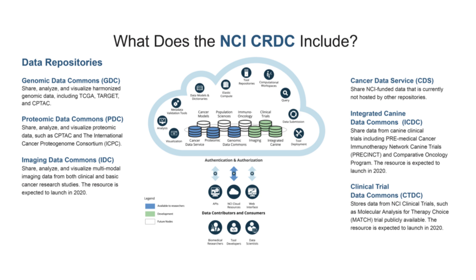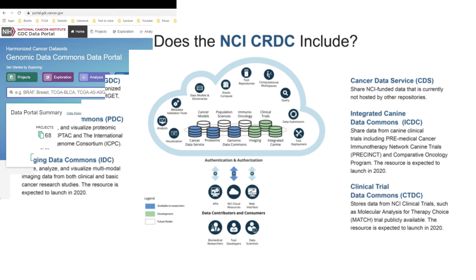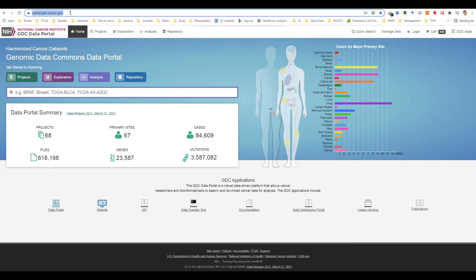The Genomic Data Commons GDC data portal provides users with web-based access to data from cancer genomic studies. The front page displays a summary of all available datasets. The GDC data portal provides five navigation options for browsing available harmonized datasets.